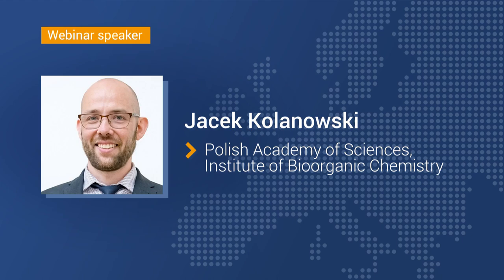I'm sure that many of you know that the simultaneous observation of multiple targets in biological models allows for more comprehensive understanding of the processes and specific capturing of the function of bioactive molecules and their interactions. This in turn allows for more reliable early stage identification of molecular tools and drug candidates and gives insights into their mechanisms of action. In this talk, Jacek will present the work of his group on the design and development of fluorescent and bioluminescent probes and assays for multiparametric screening and high content or ultra super resolution imaging.